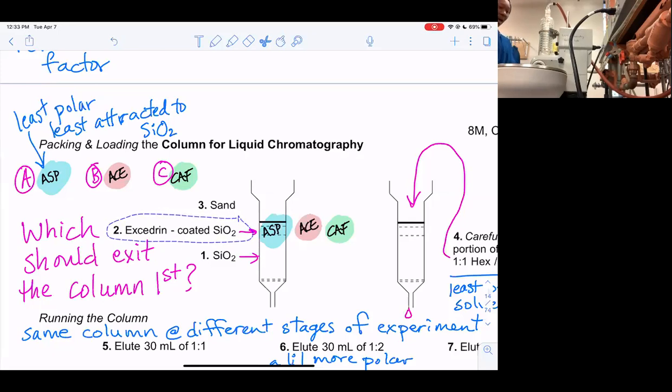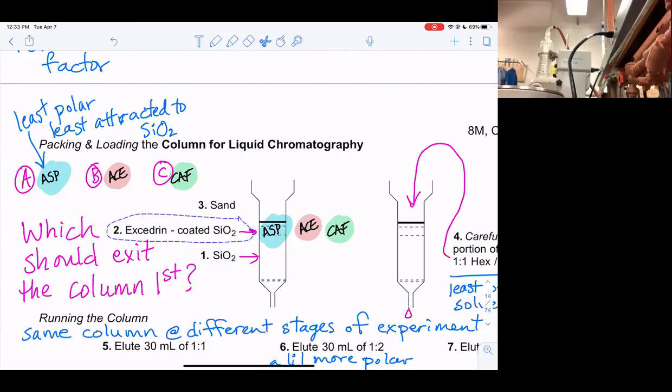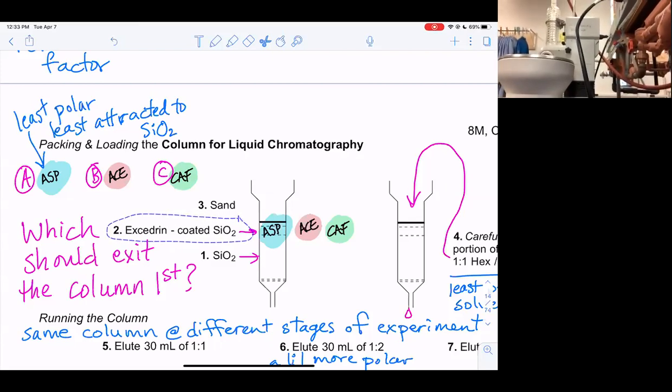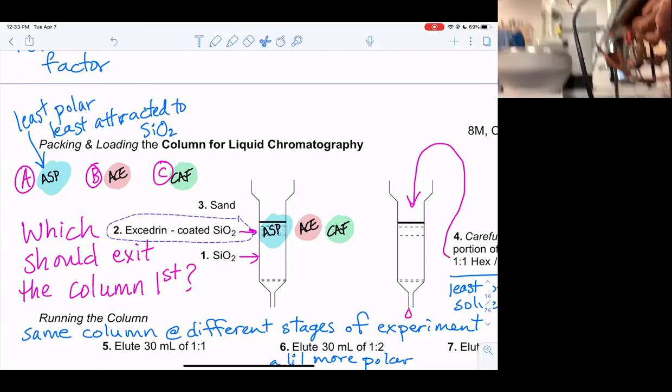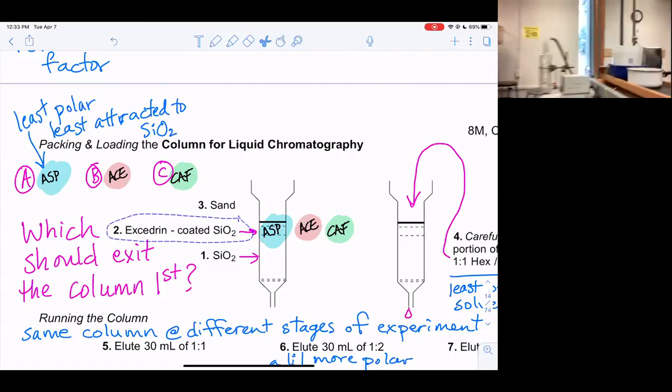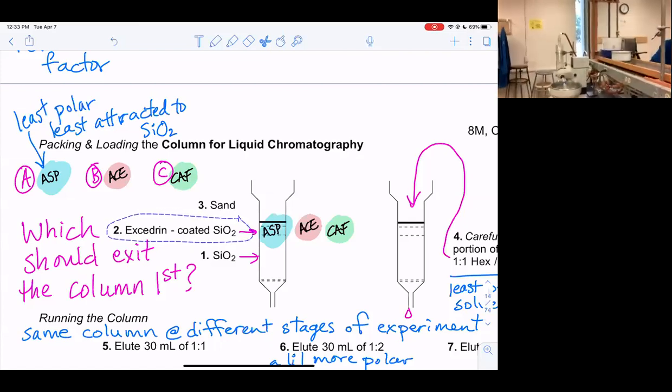And the last thing is you need the vacuum. So these labs are a little weird. The vacuum is on the other side of the bench. Oh, thanks, Avery. So. Social distance. Yeah, so. Social distance rotovap.